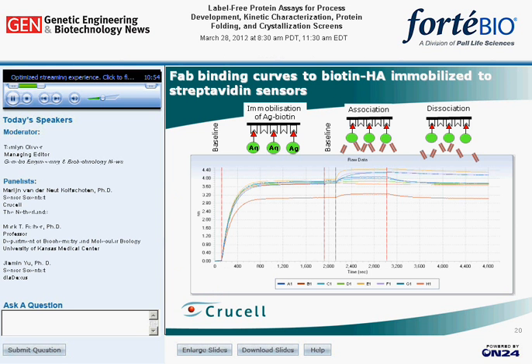The typical experimental approach is depicted in this slide. Due to the pH instability, hemagglutinin molecules are first biotinylated, followed by immobilization to streptavidin sensors. Next, association and dissociation of Fabs to the HA molecules is measured. The advantage of this approach is that the biotinylated HA molecules can be reused.